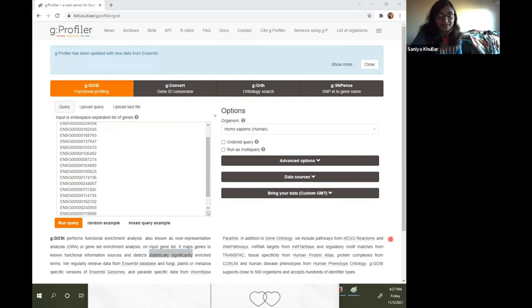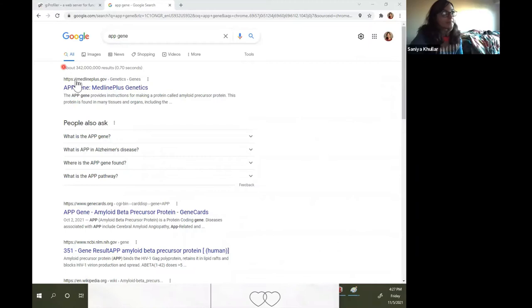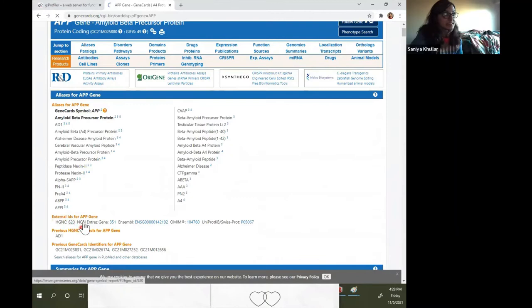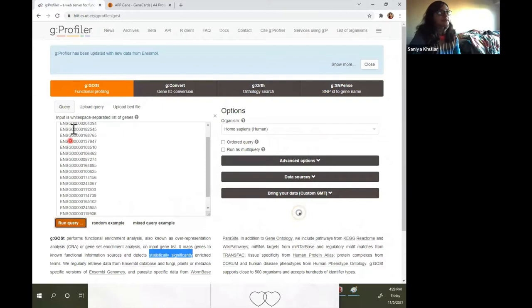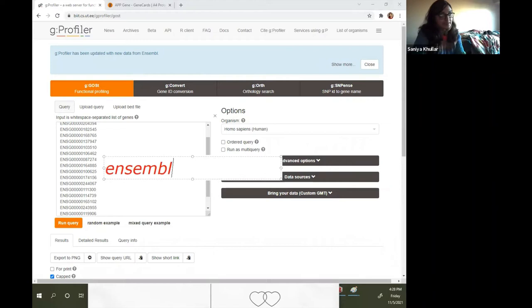You might wonder what Ensembl IDs are. If you look up any gene like the APP gene in Gene Cards, you'll find that each gene has an HGNC symbol, an Entrez ID, and an Ensembl number as well. There are many different symbols and aliases for genes. These are gene names in Ensembl form — Ensembl gene IDs.